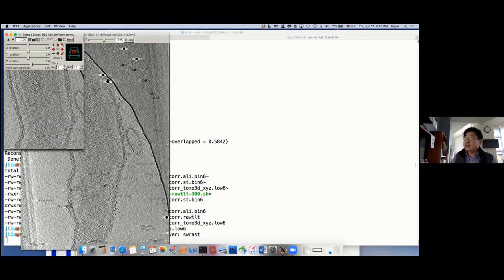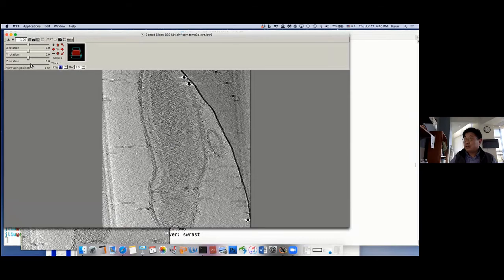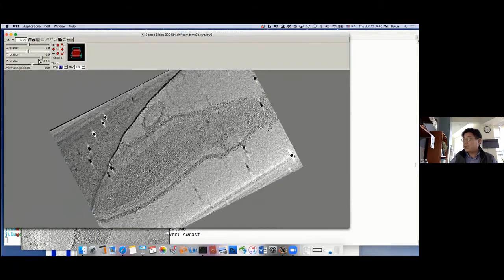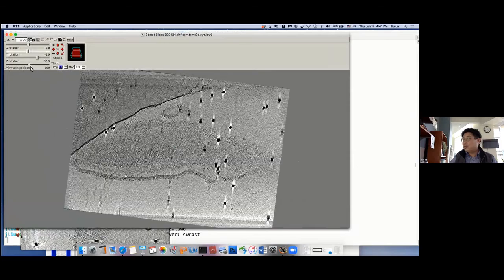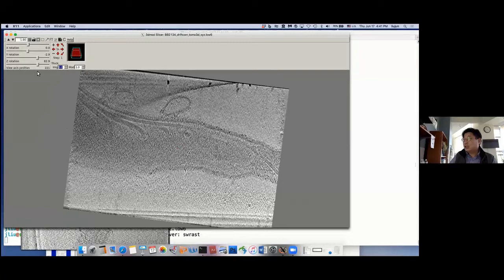And then you can use this slicer and basically change to different orientations, or maybe change to Z. Then presumably you can get some nice snapshots, including the flagella and many other features, lipid, outer membrane vesicle, membrane, and you can zoom in, zoom out.